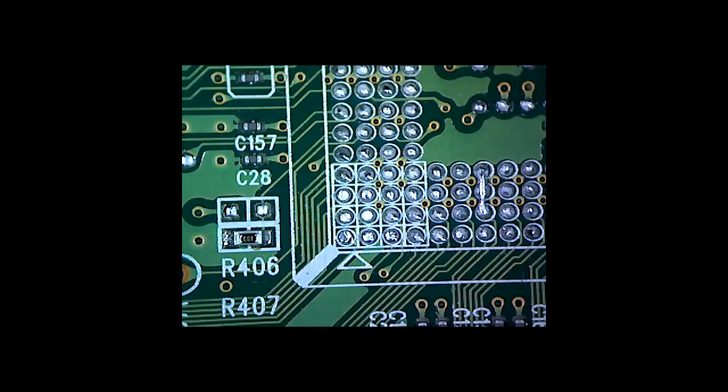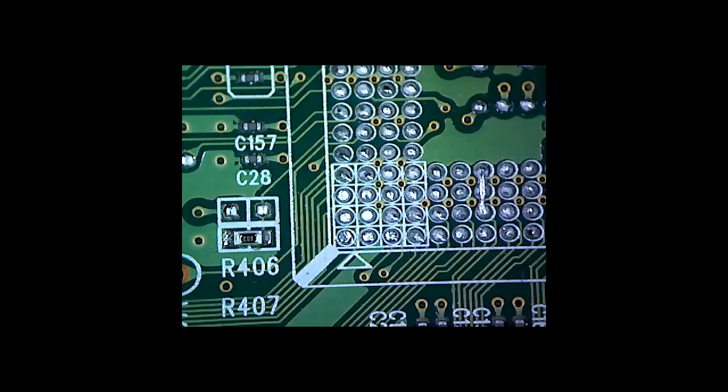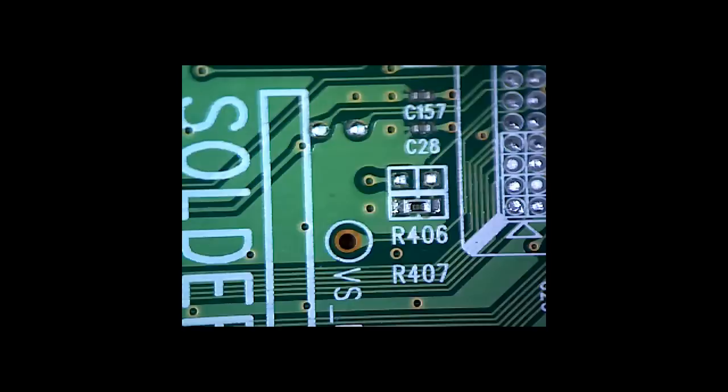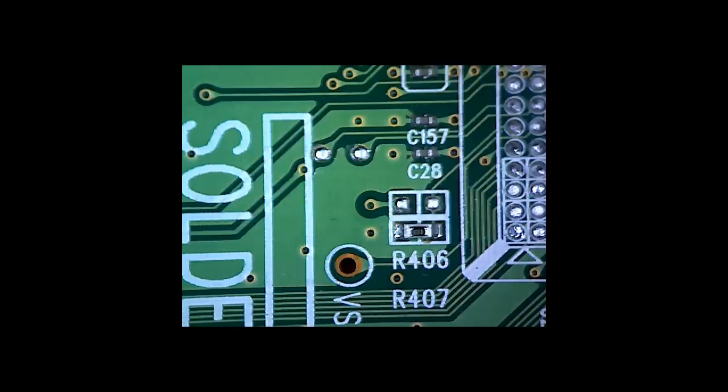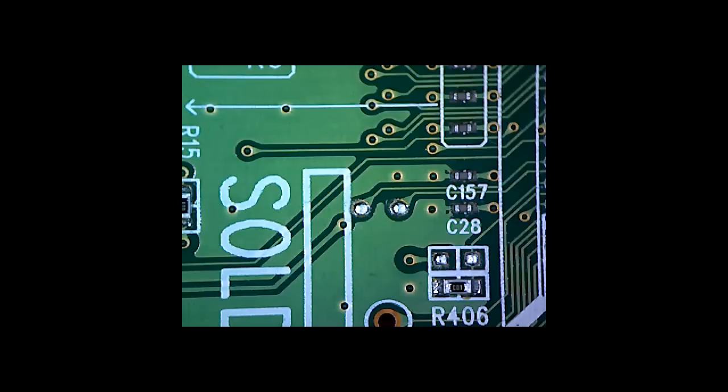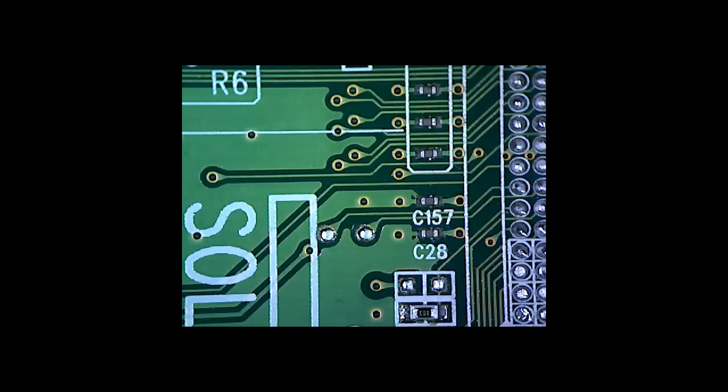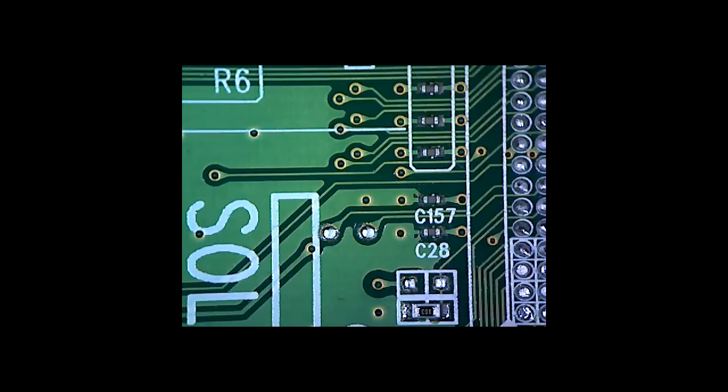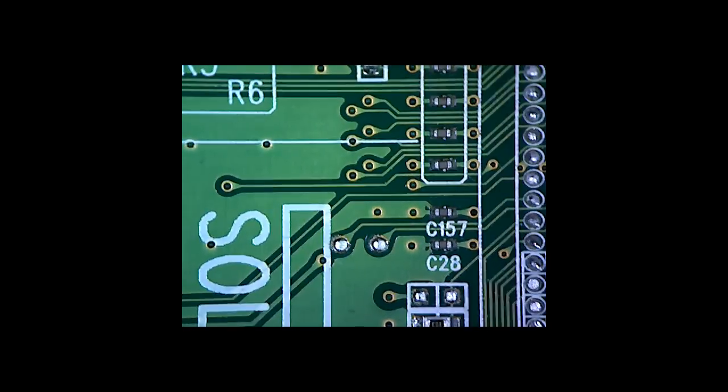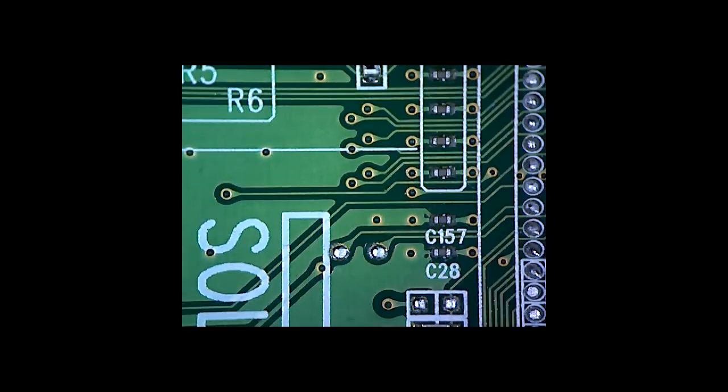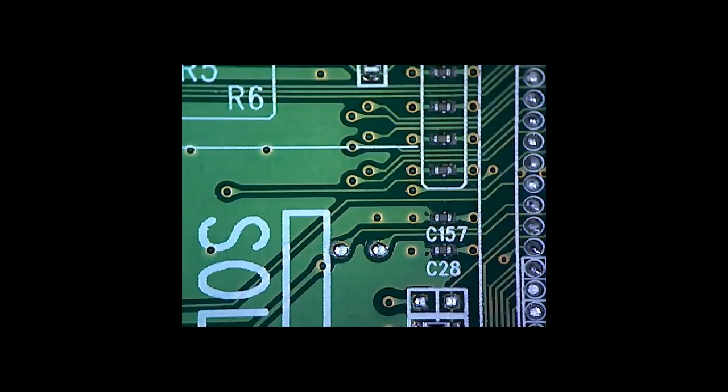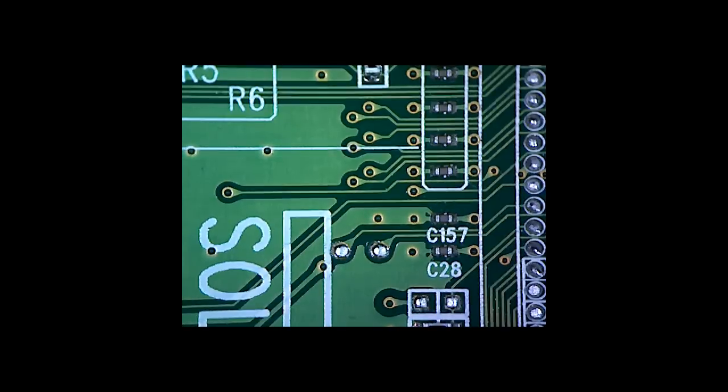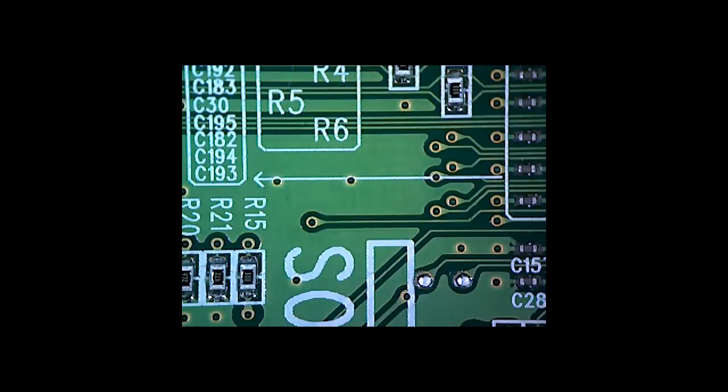This latest version of the software has crosshair and overlay function. Let me just try it. Yeah, hopefully you can see that there's a crosshair now appeared on the screen. That may well be useful for aligning certain things. It's an option that didn't seem to work in the supplied version from Vision Engineering, it was just blanked out all the time. One of their guys seemed to think that there was another option somewhere in the menus that would allow that to work. If there is, I couldn't find it.